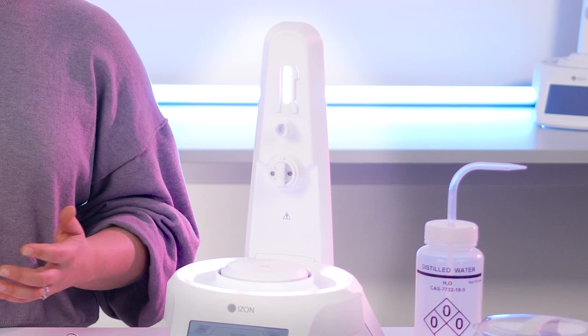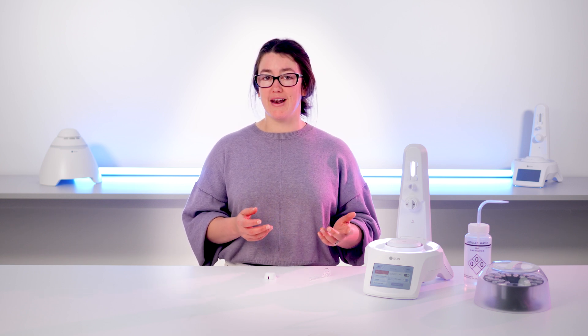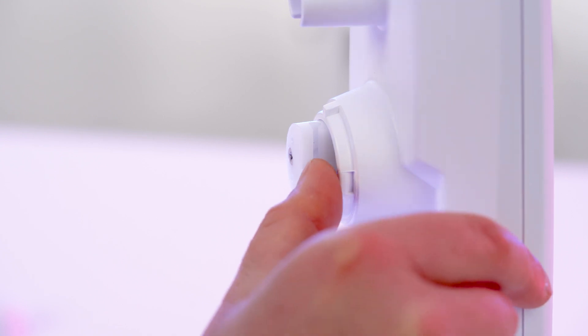There is one quirk you should know here. The valve is designed to function with a tube in place. In this case, we don't have the tube in yet. So you might find that when you open the valve in the settings menu, the valve does not open. To get around that, you might need to encourage it to open lightly by touching the hammer of the valve. You'll hear it click when it does open.